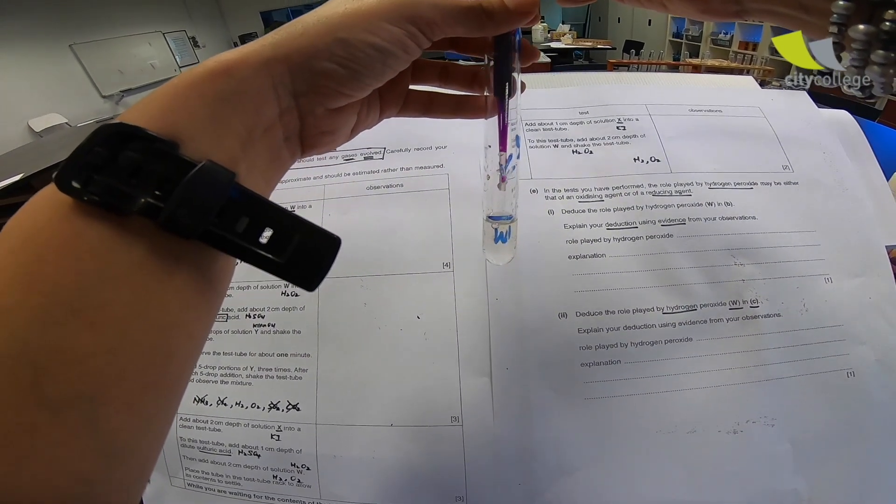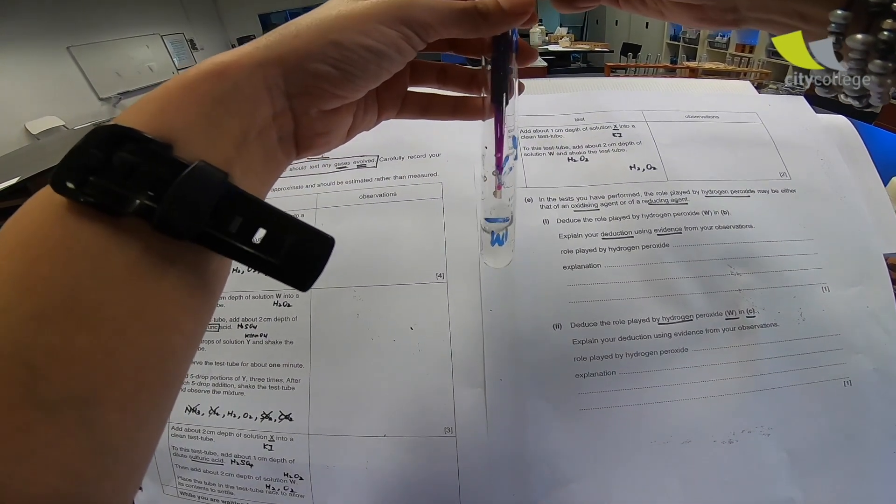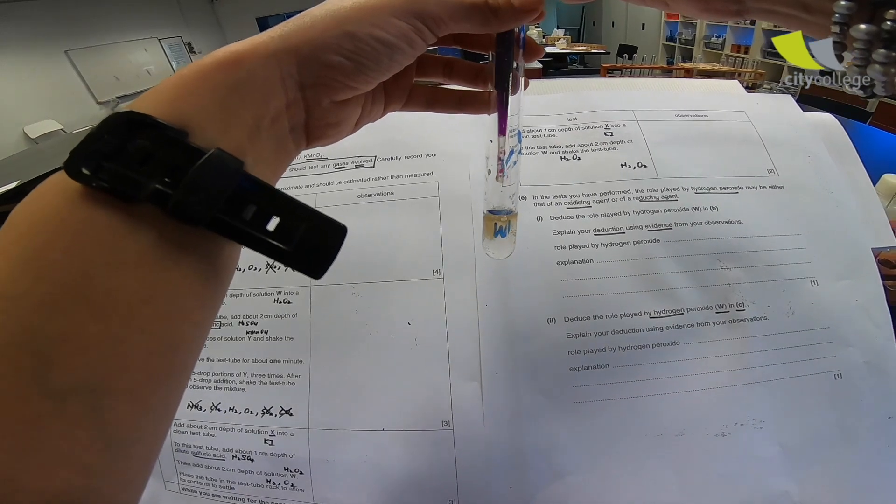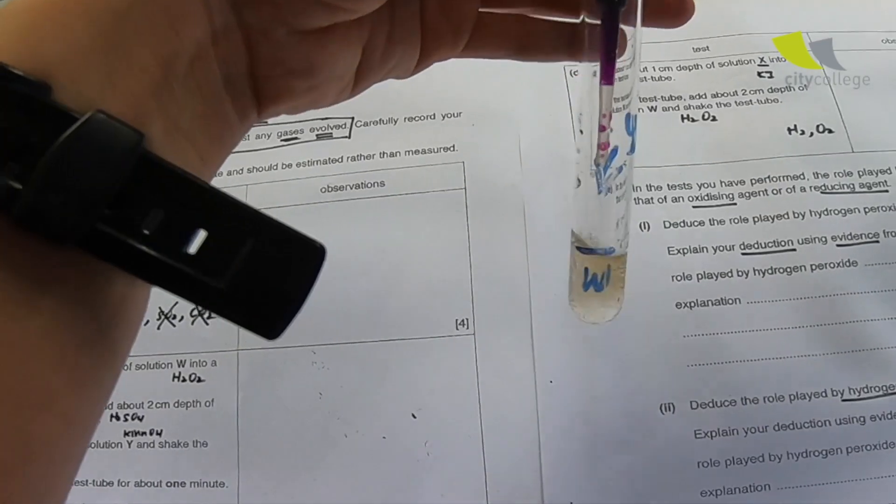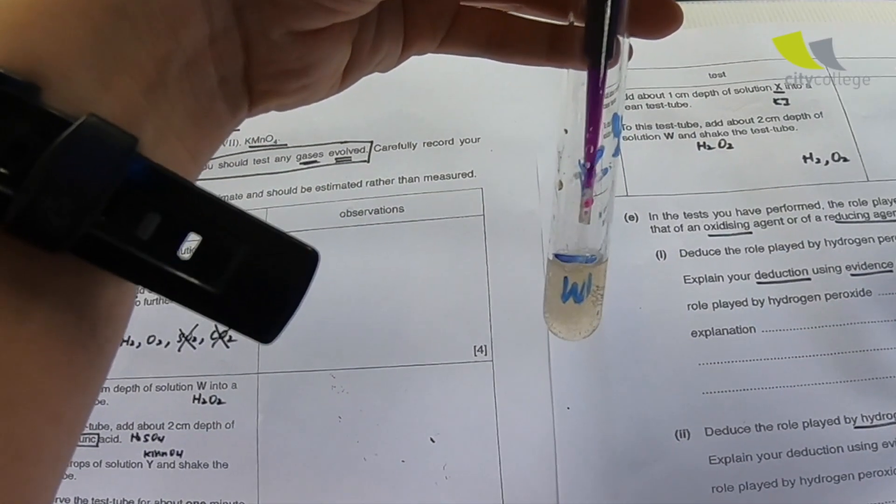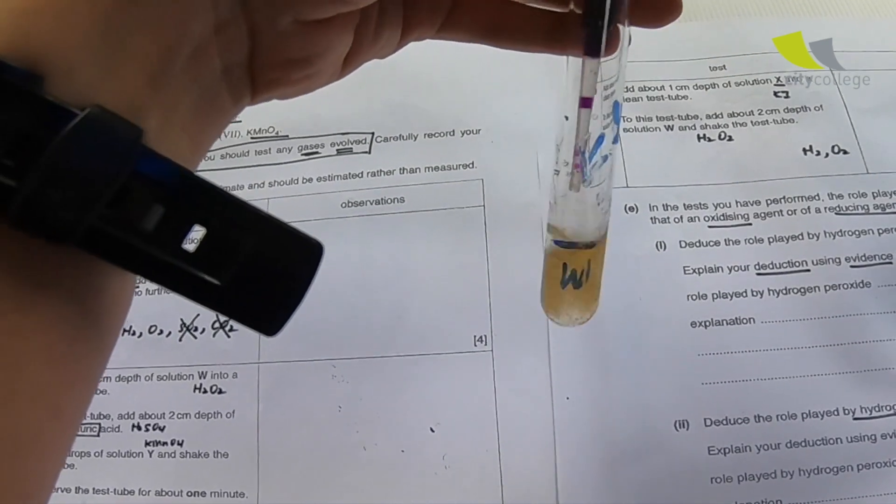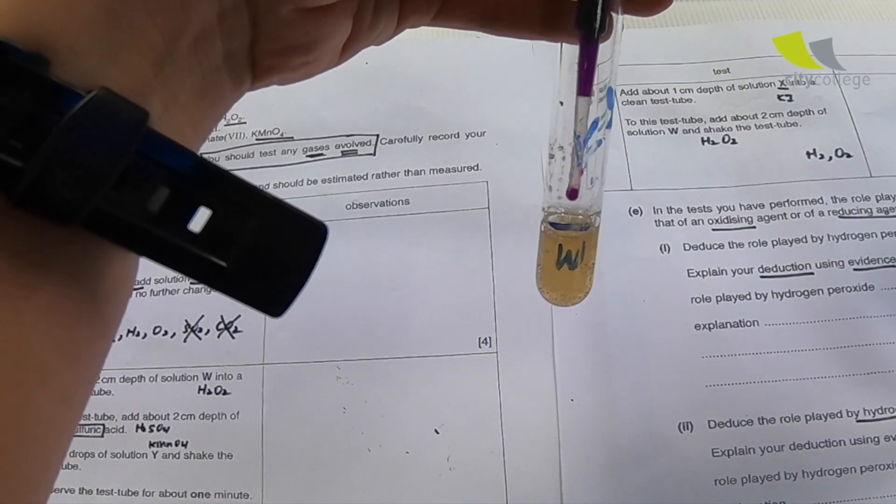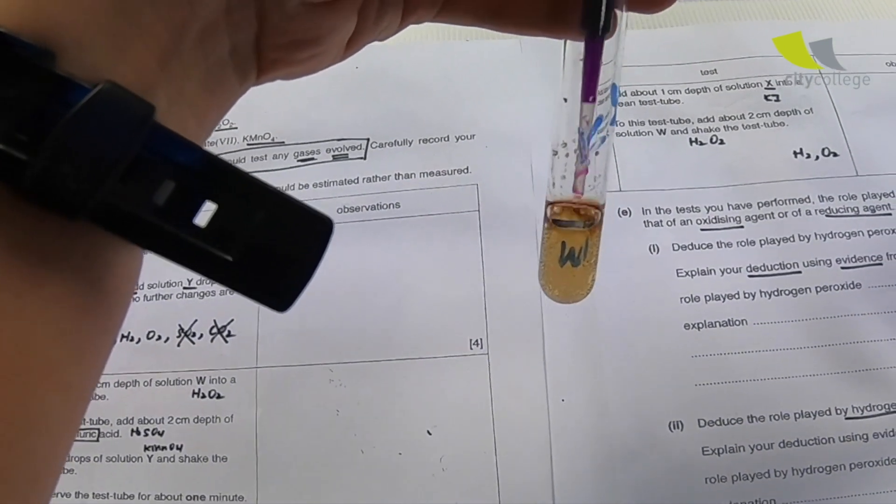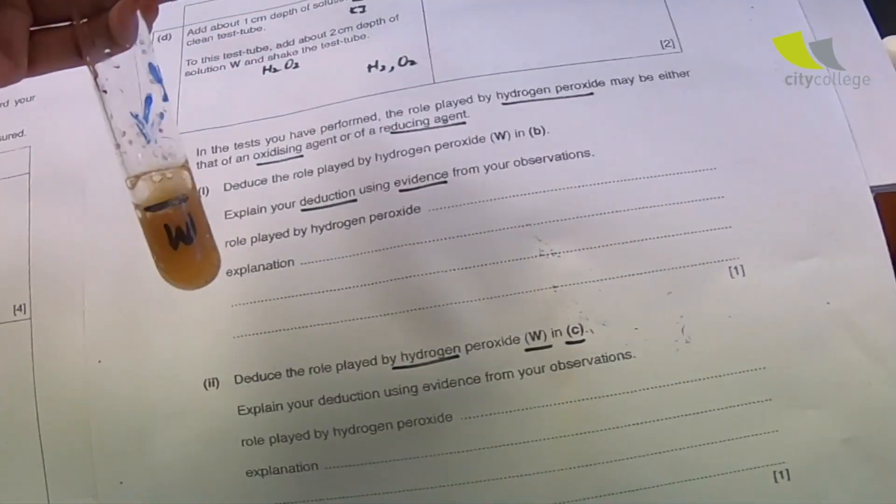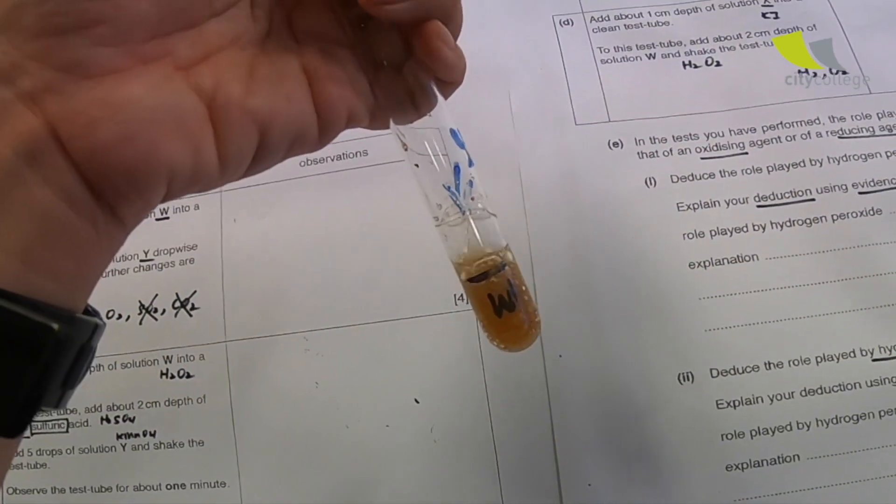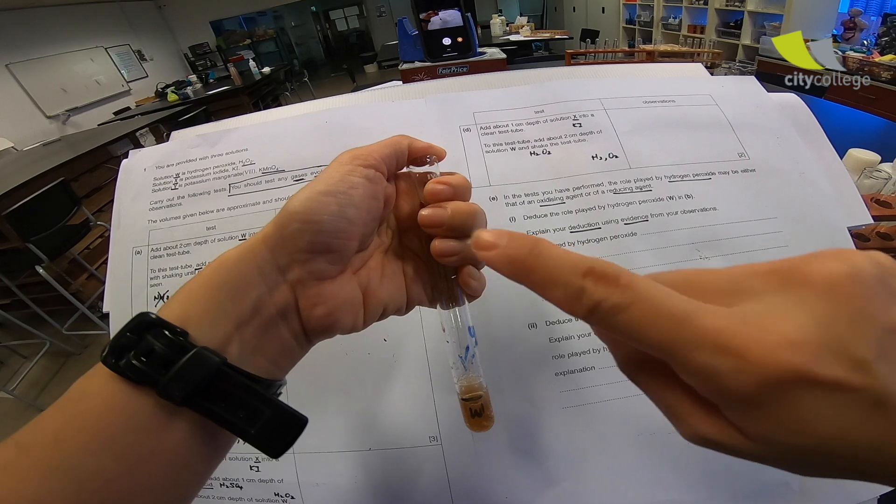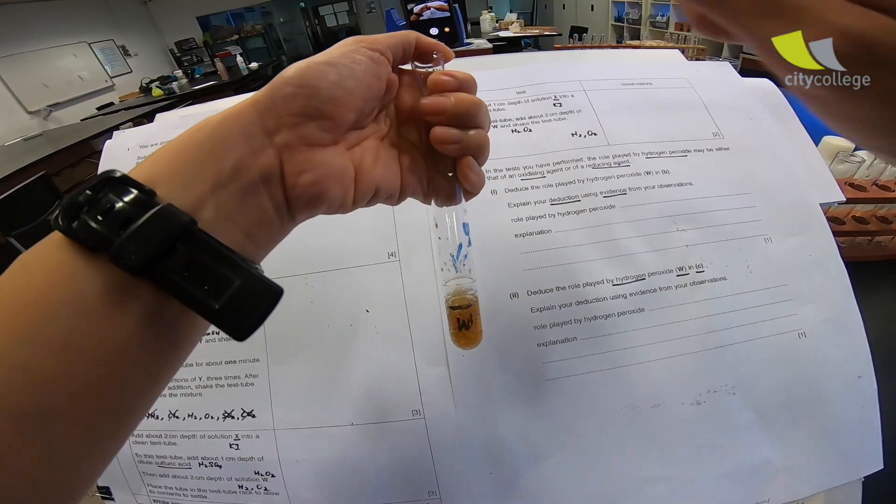The moment I add a drop, you notice that the purple decolorize, but I see a pale yellow solution with effervescent forming. There are gases coming up. More gases. And they say, add until no further changes are seen. Means that, as I add, they should give me a permanent color. A deep yellow solution. I use my thumb to cover to prevent the gas from escaping.